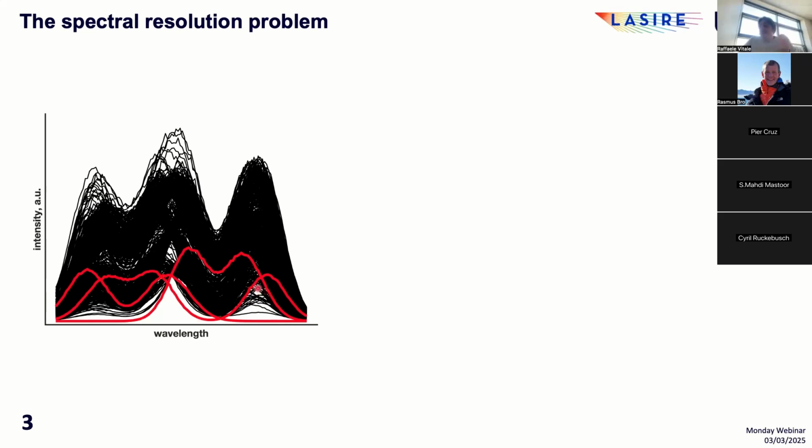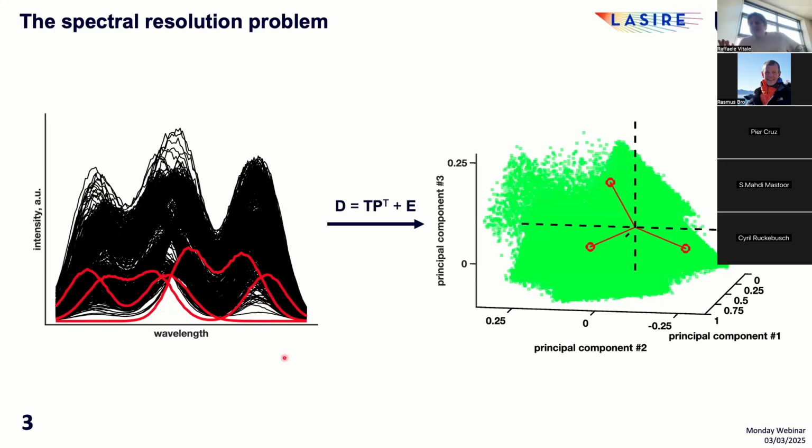Now, the ternary mixture problem this dataset intrinsically encodes can be graphically visualized in a very simple, intuitive, and straightforward way. If I take this dataset and subject it to principal component analysis, and I represent the resulting scores, the points associated to the aforementioned pure component spectra only initially fall within the scores point clouds without defining any easily recognizable direction in the PCA subspace.